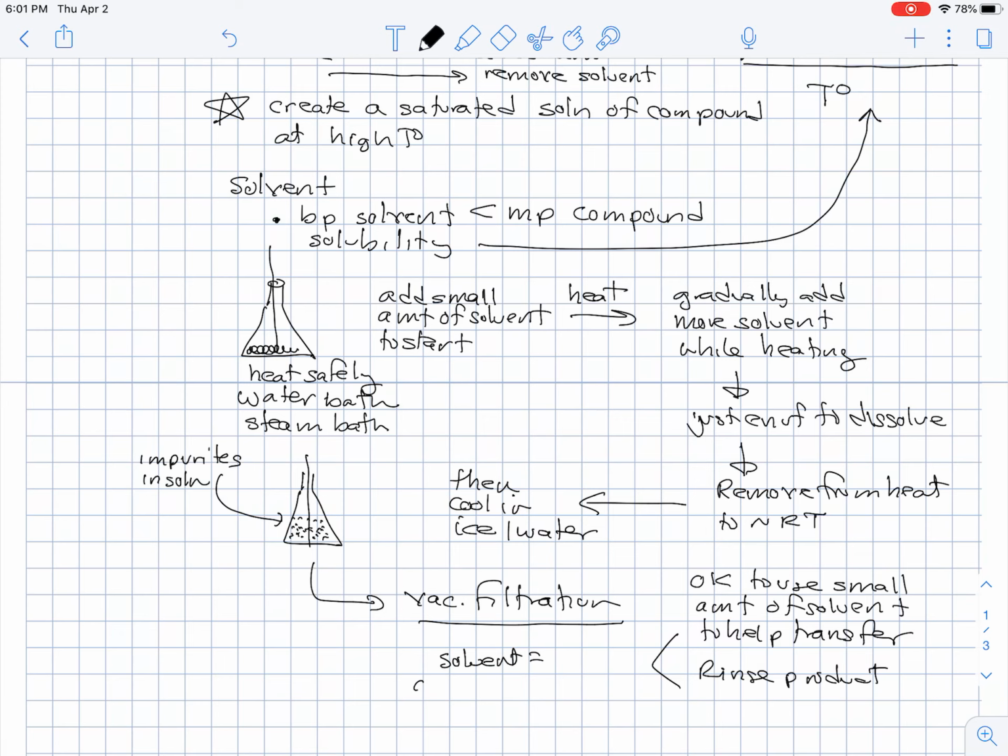And the solvent that you pick, you want one in which the product doesn't dissolve. It's pretty disheartening when you've gone through your whole recrystallization and you wash your crystals and they all disappear. Generally, what will work quite well is whatever solvent you use in the recrystallization, because you know that that solvent is one in which the compound doesn't dissolve when it's cold.